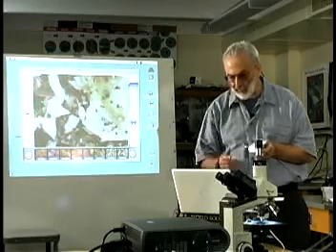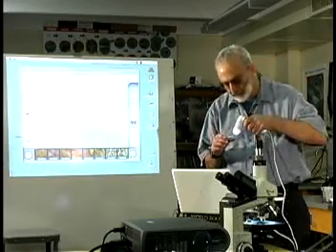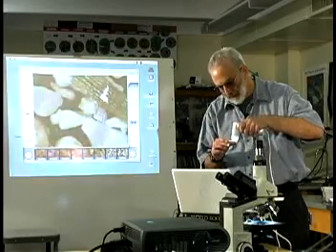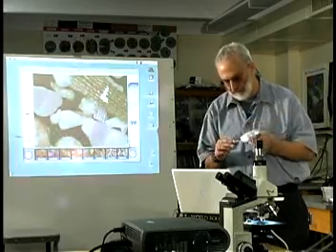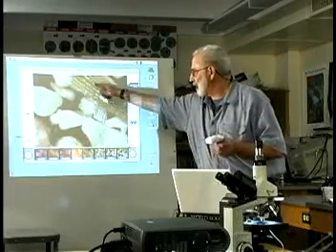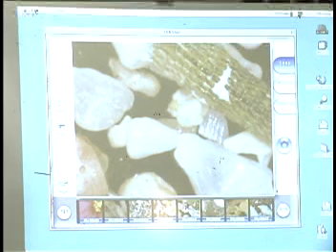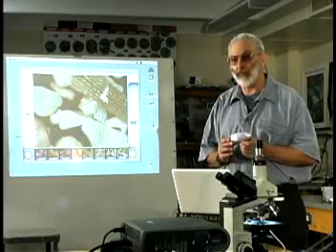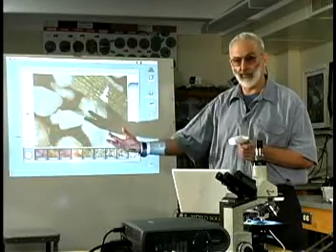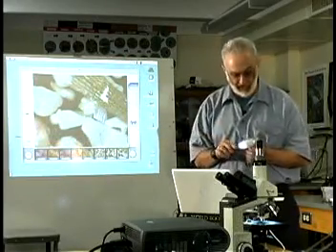Secondly, we'll switch over to another sample. This particular sample is our sample from Bermuda. I'm just going to zoom in here and take a picture. And what we have in this picture is a beautiful sea urchin spine. We also have all kinds of shell fragments, and notice, no sands at all. Okay? We have some coral fragments also, and so we'll take a better look at this particular sample, and we'll be able to compare it from an island sample to basically a terrigenous beach sample.